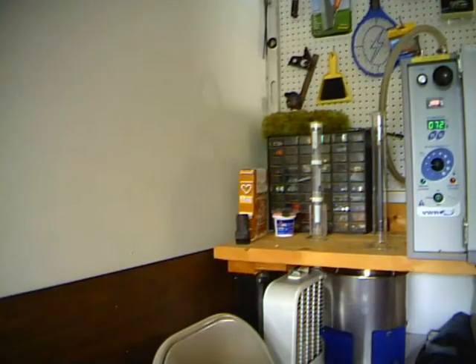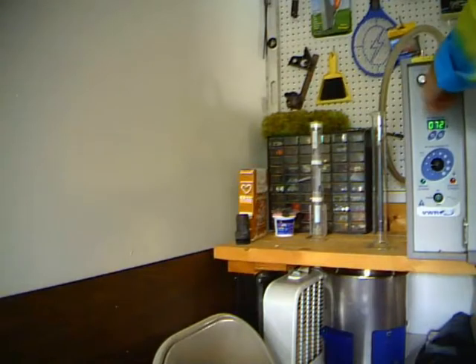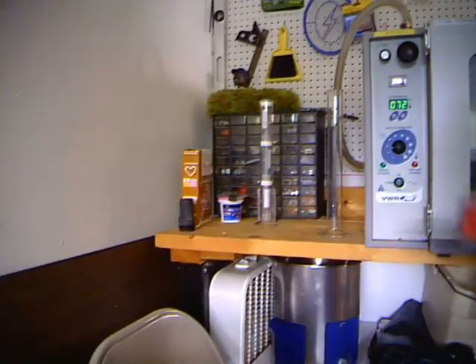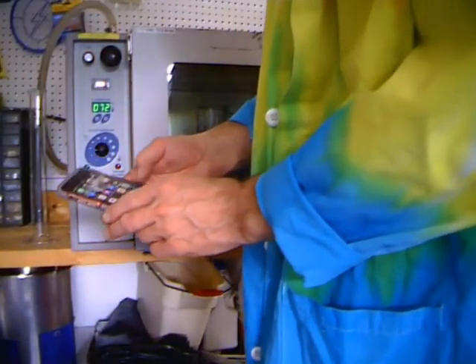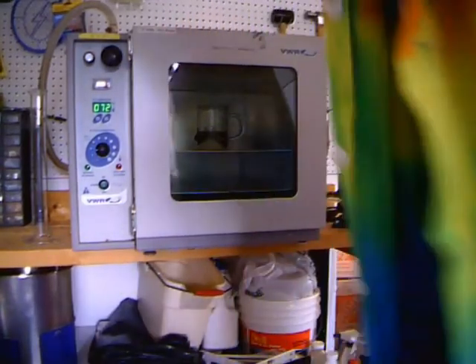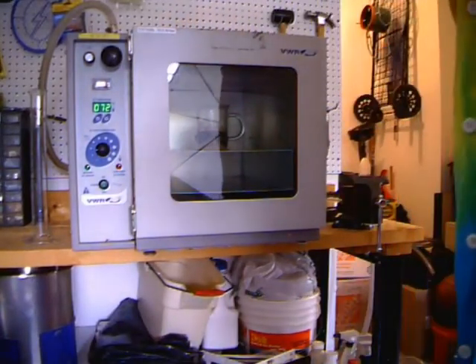I'm going to go ahead and turn off the vacuum pump and seal the vacuum in there. It was making a bit of a mess, so I turned off the pump. I'll leave the temperature on. I'm going to set a timer for two hours and come back to see what the instant coffee looks like in there.